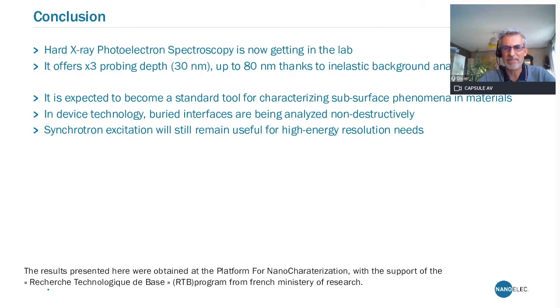I am done with my talk. Just a few words of conclusion. To mention that HAXPES, hard X-ray photoelectron spectroscopy, is now getting into the laboratory. The spectrometer is very versatile.